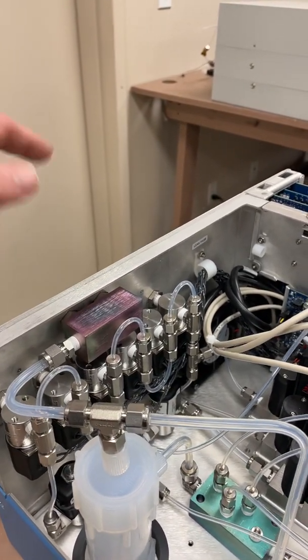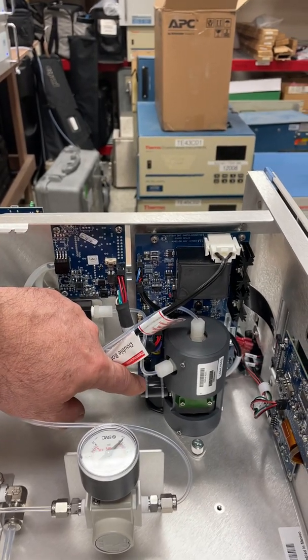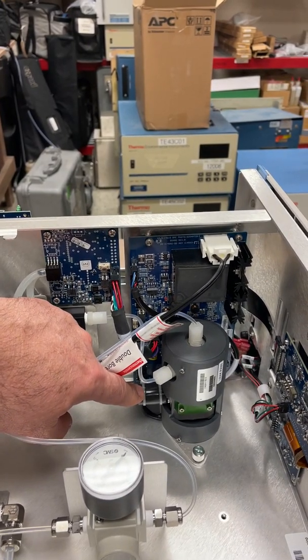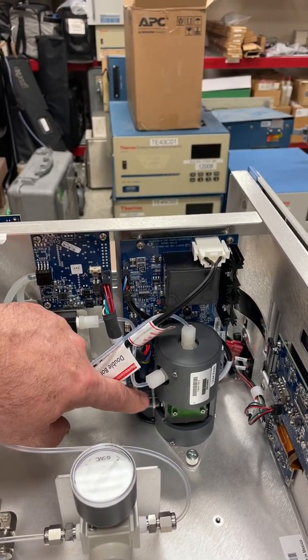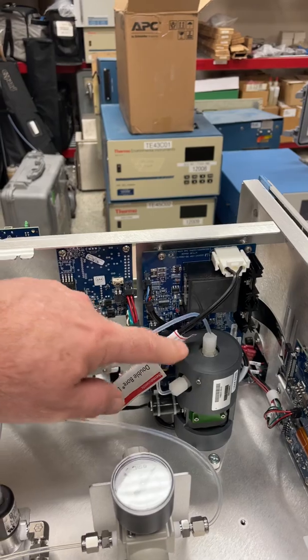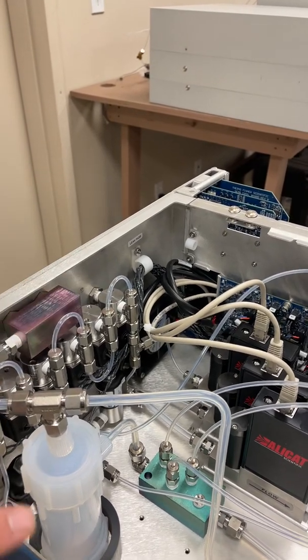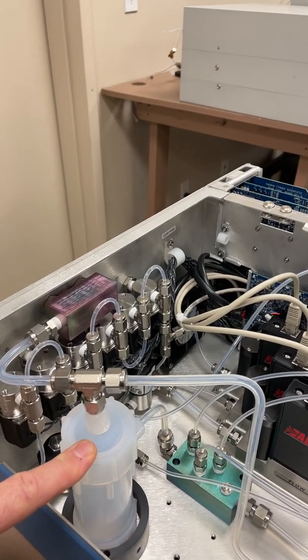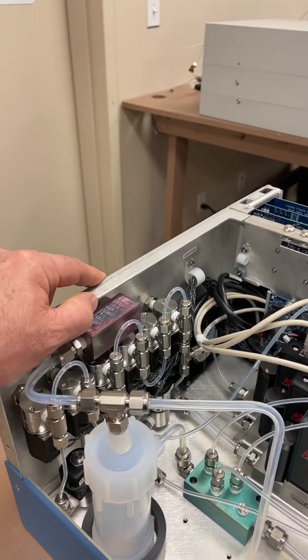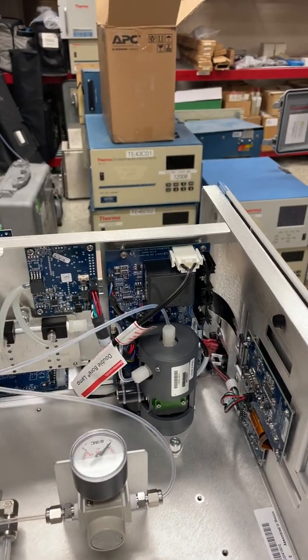This unit also has an ozone generator — this little cylinder here at the base. It has an ozone lamp, and by controlling the power to this lamp, either increasing or decreasing the power, you increase or decrease the intensity of light from this ozone lamp. You can calibrate an ozone analyzer with this chamber, or you can use the ozone from this chamber and mix it with a known concentration of nitric oxide cal gas from a cylinder. NO with ozone produces NO2, and then you can do a gas-phase titration with the NO2 channel of your NOx analyzer. So with this ozone chamber you can not only calibrate an ozone analyzer but also do gas-phase titration for the NO2 channel.